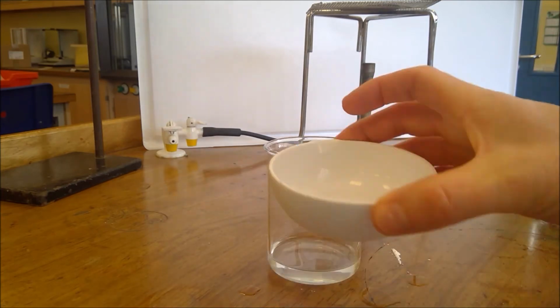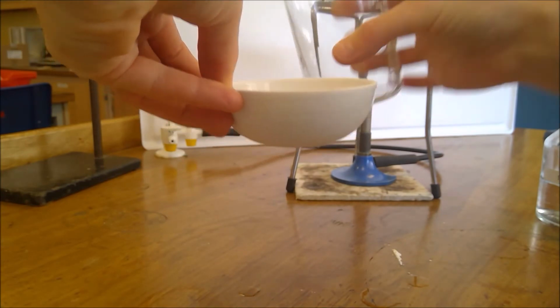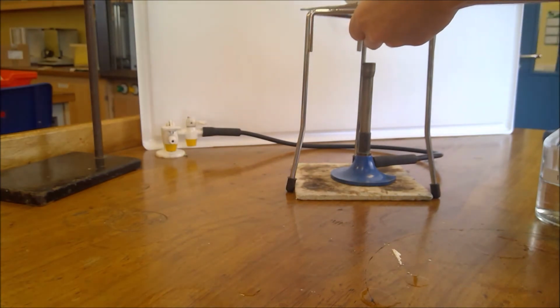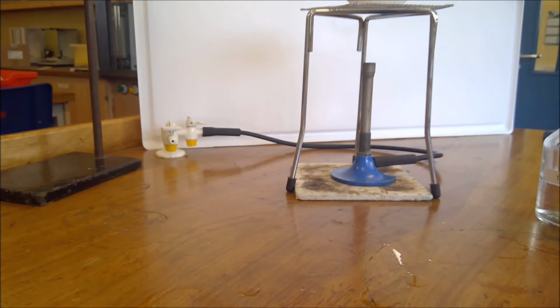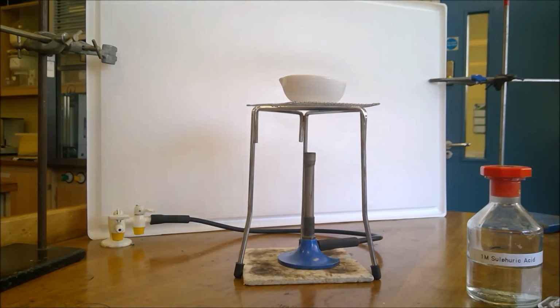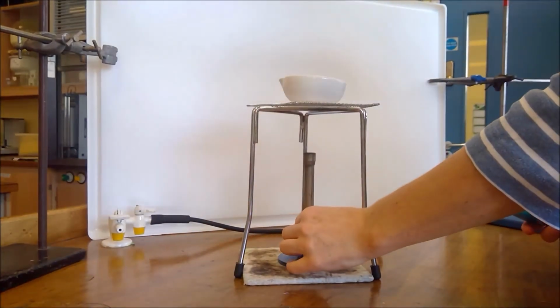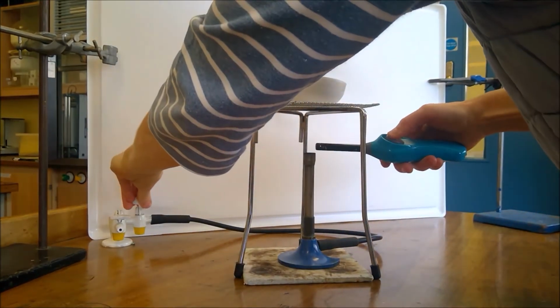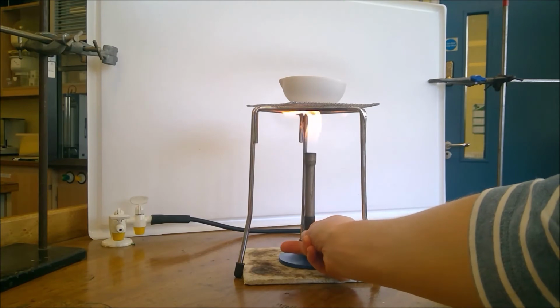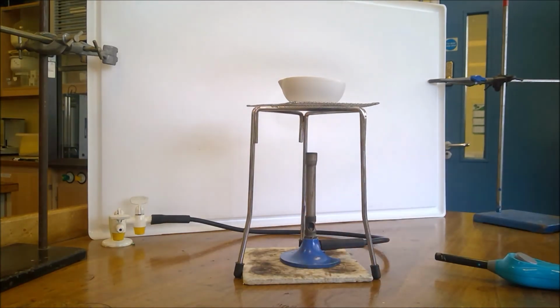So what we are going to do is pour our solution into our evaporating basin, and then we are going to heat this over a Bunsen burner. So let me just move this up a little bit so that you can see what's going on there. Okay, so our evaporating basin is now on our gauze over our Bunsen burner. So we light that on a safety flame, but we want to drive off the water here. So we'll turn it instantly onto a roaring flame there.